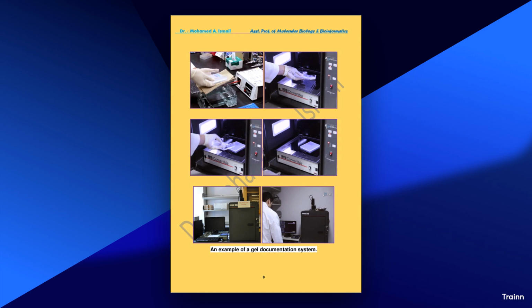Causes. High complementarity: primers with significant self-complementarity are more likely to form hairpins. Solutions. Design primers carefully. Use software tools to design primers with minimal self-complementarity. Check melting temperature, Tm. Ensure Tm values are appropriate for the specific PCR conditions. References. Kumar, A., and Kaur, M., 2015. Primer Design for PCR: a comparison of different software tools. International Journal of Current Microbiology and Applied Sciences, 4, 11, 126-135.